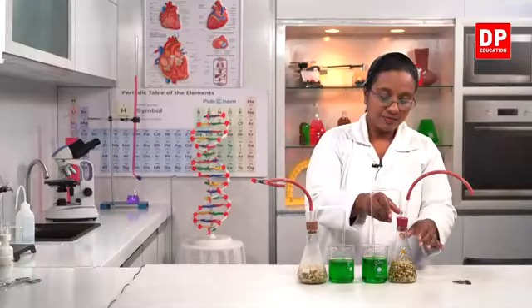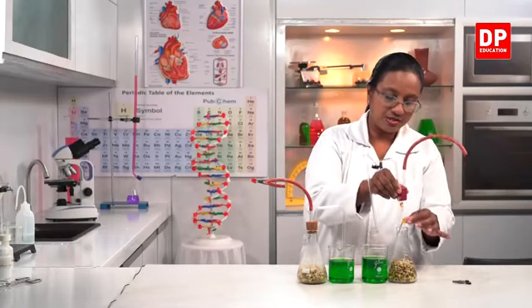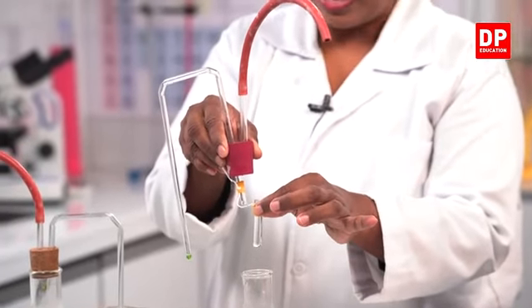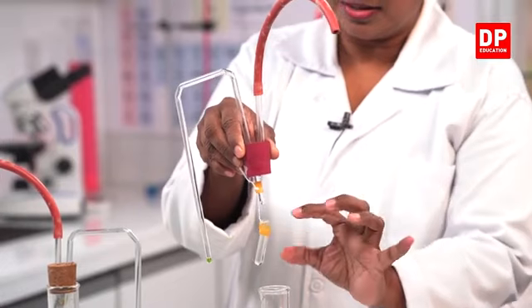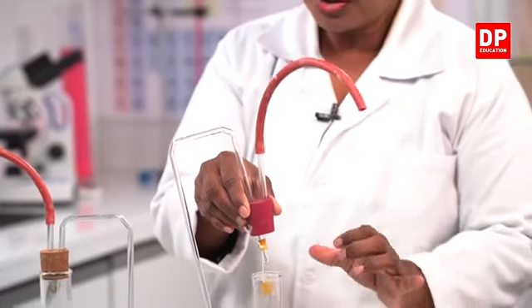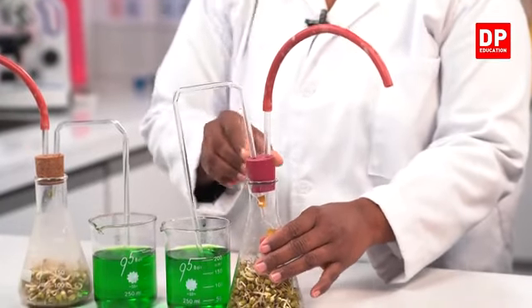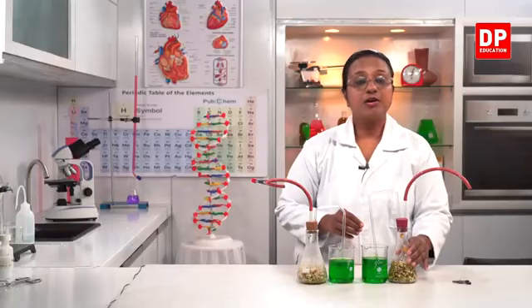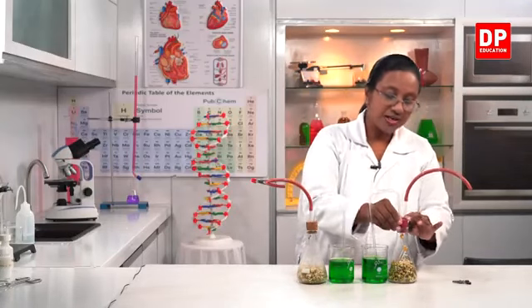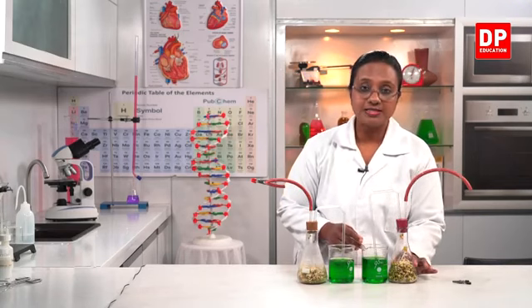At the same time, I have the other setup, same thing, but here you can see, students, inside this small test tube, I have taken a little volume of potassium hydroxide. You all know the purpose of using potassium hydroxide. What is it? Potassium hydroxide absorbs carbon dioxide. So that additional small test tube with KOH is there in this setup.